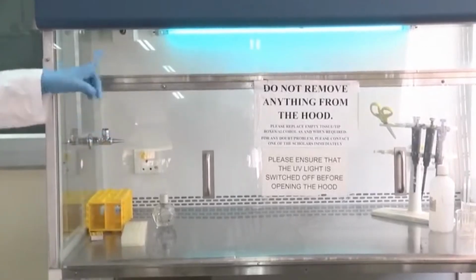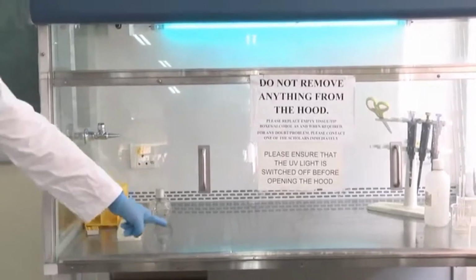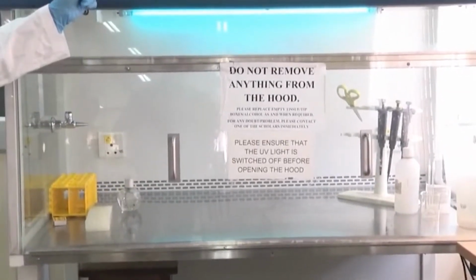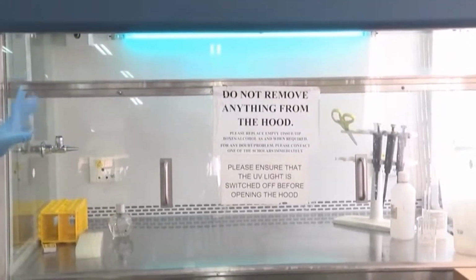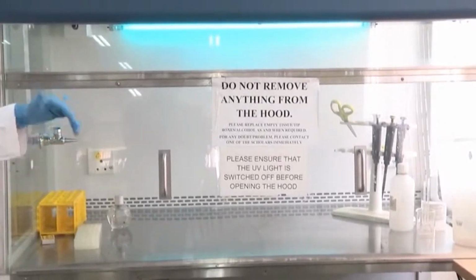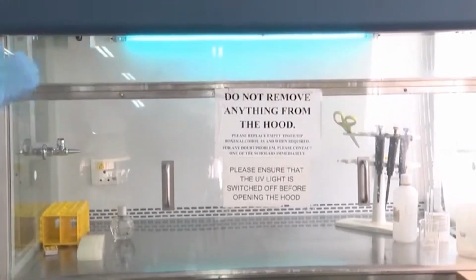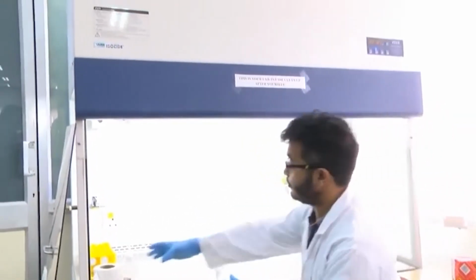Apart from that, right now we have a UV lamp which is switched on. You will see some bluish reflections from the metal surface. So, basically we have an ultraviolet lamp on top, and it is ensuring that the inside is sterile. Once it finishes its cycle, only then can we switch on the laminar airflow, take out the lid and start our work. So, we have switched on the laminar airflow and now we will begin our work.